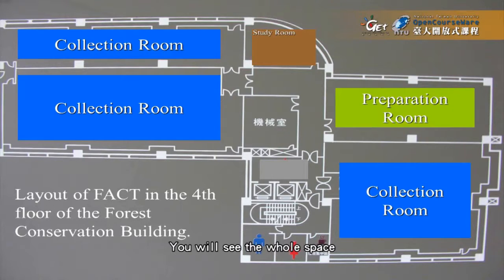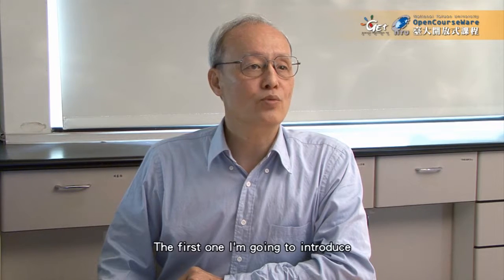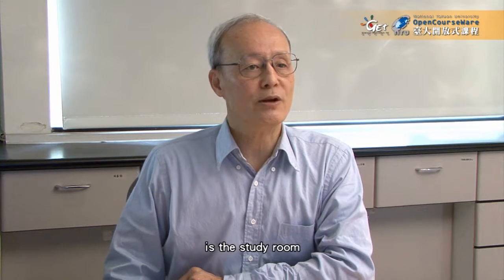This is a layout of Forest Arthropod Collection of Taiwan on the 4th floor of the forest conservation building. You will see the whole space is separated into several big blocks, including a study room, a preparation room, and the 3 collection rooms. The first one I'm going to introduce is the study room.